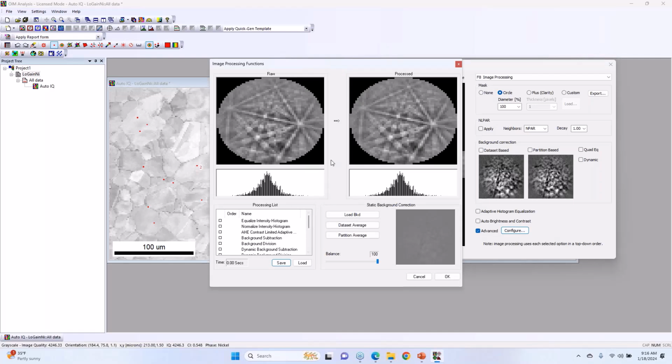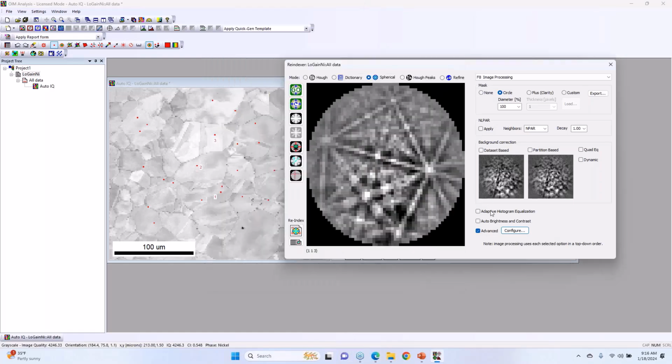So one question we had was on doing TKD with things, and TKD, depending on how you prepared it, you might have a variable sample thickness. So a single background doesn't work with that. And so we can do some dynamic things with this recipe toolbox to address things like that. Also, as we go to low beam doses with the clarity, sometimes division works better than subtraction. So we have these. You can save them as recipes for different applications.